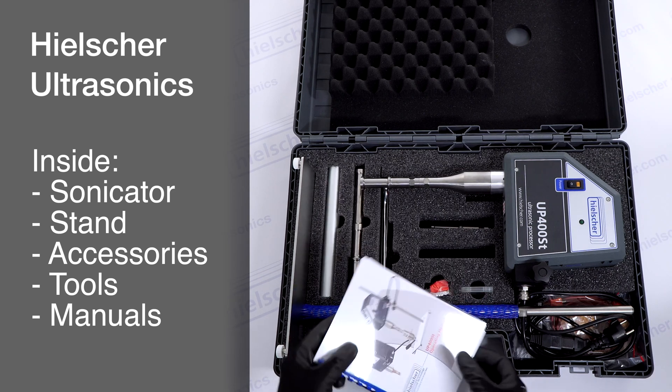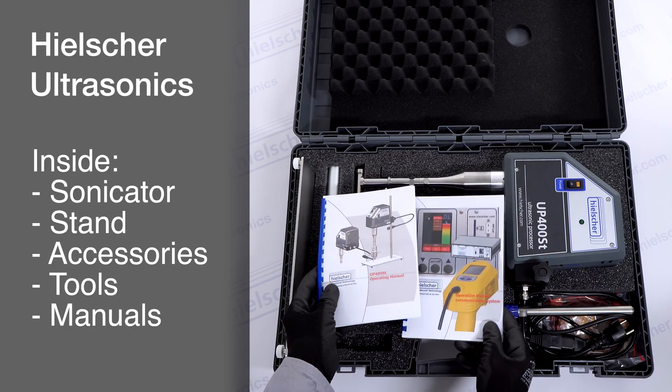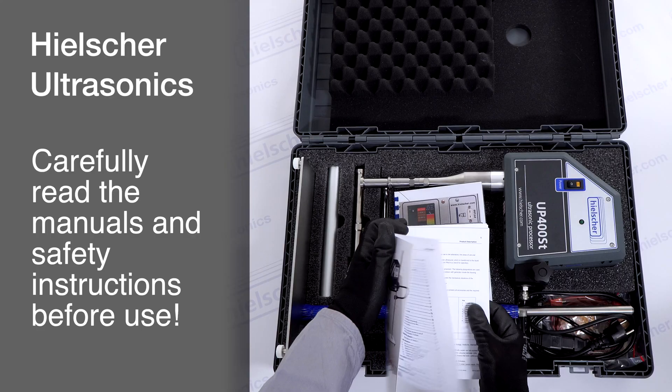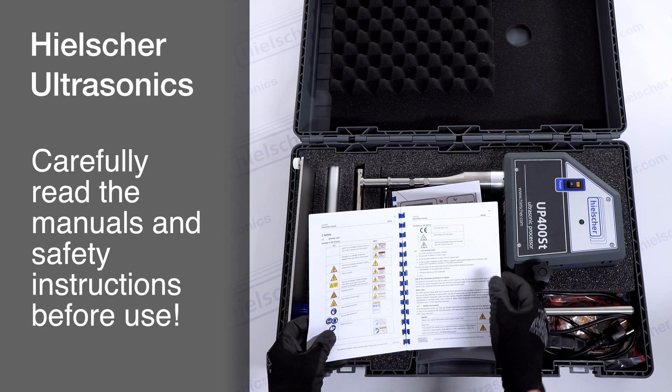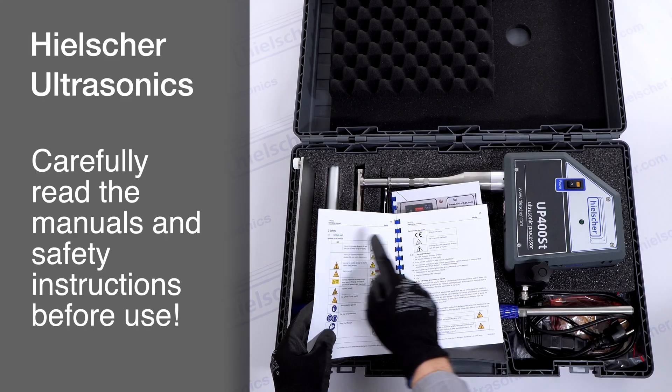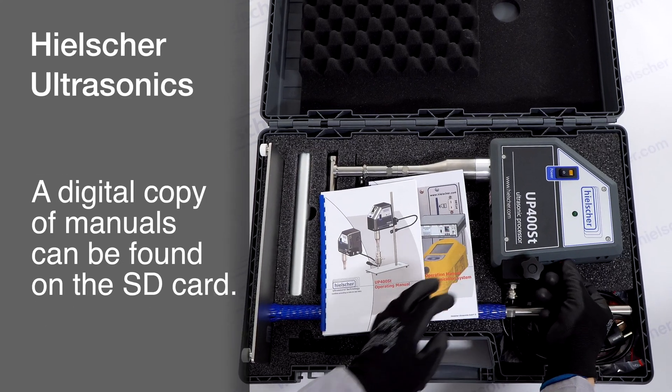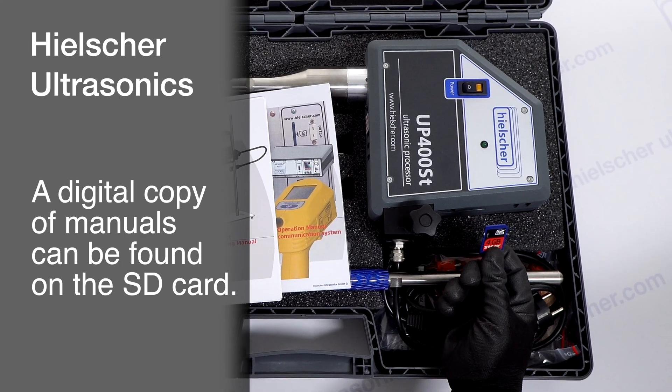To begin, please remove the user manuals from the case. For your safety and the smooth operation of the device, carefully read the manuals and, in particular, the safety instructions before first use. A digital copy of the manuals is also available as a PDF on the supplied SD card.